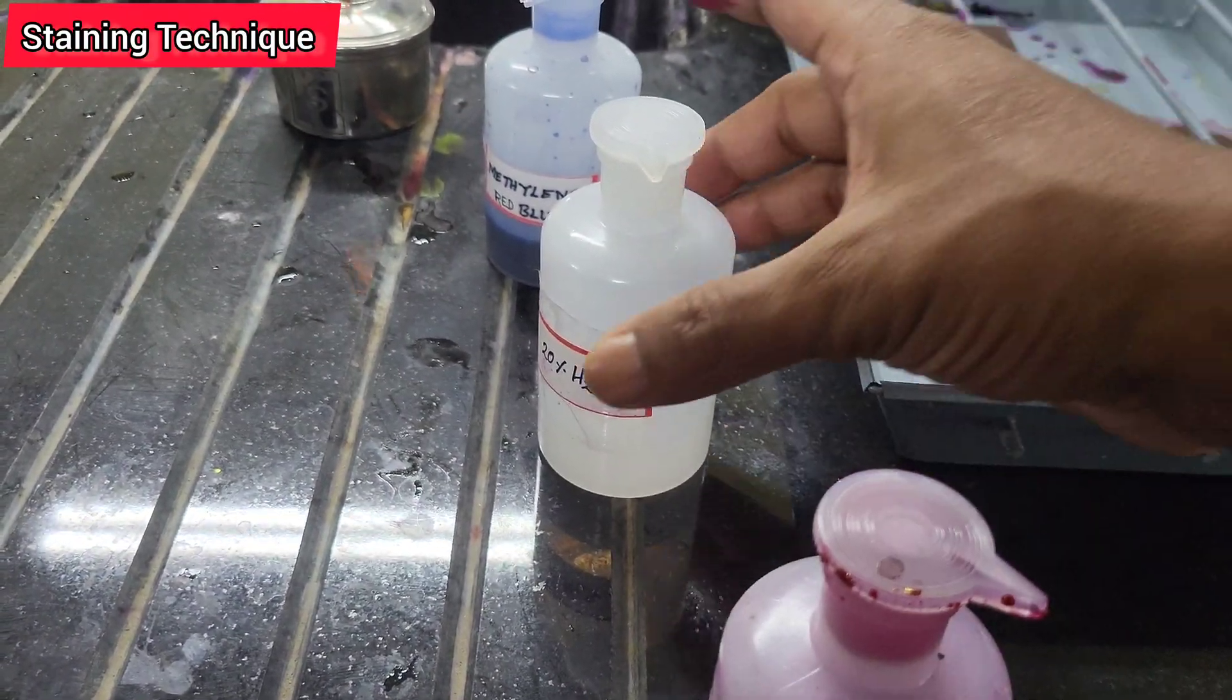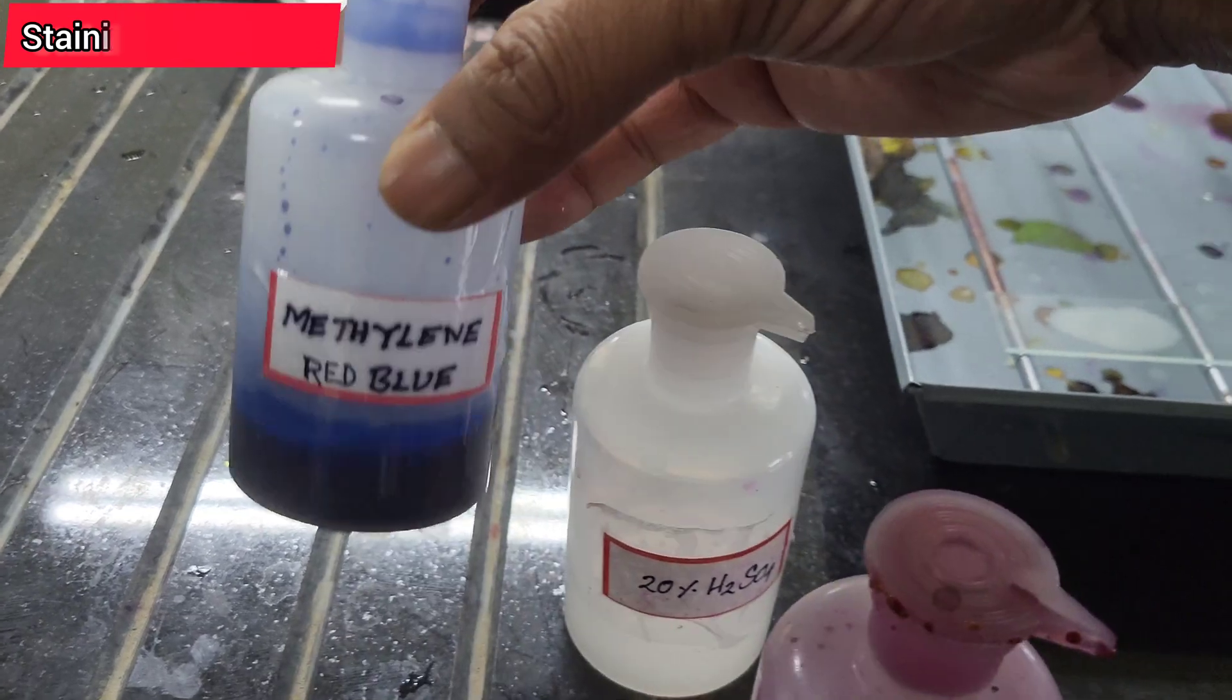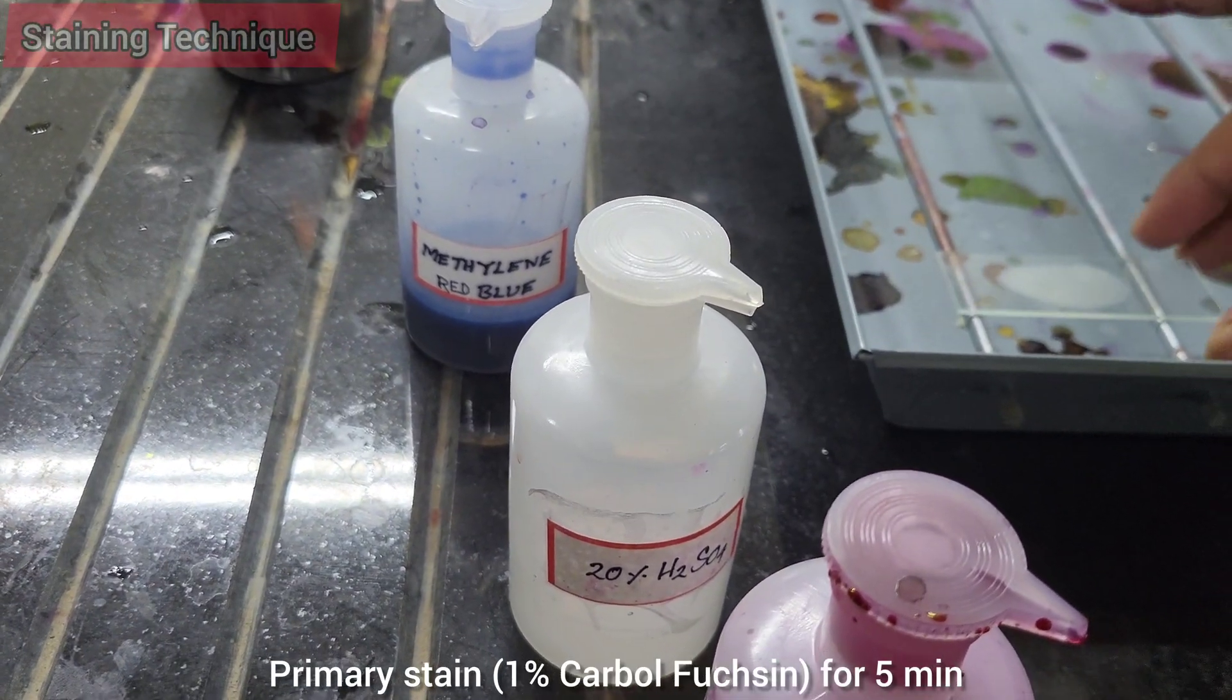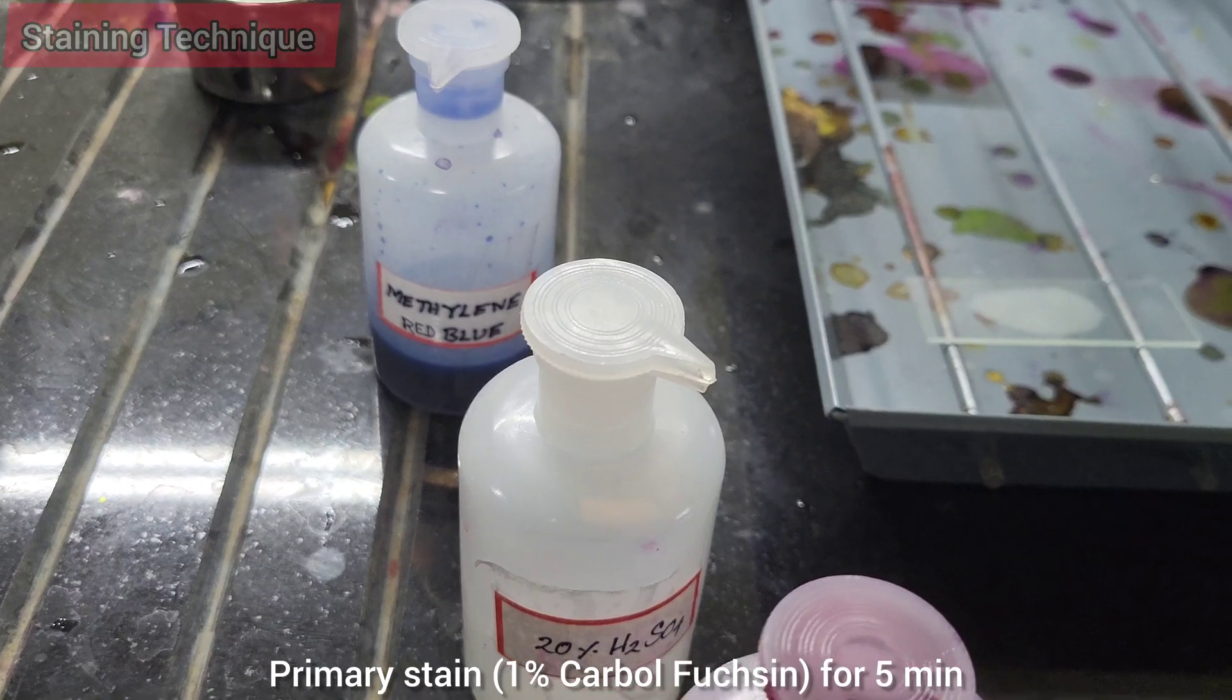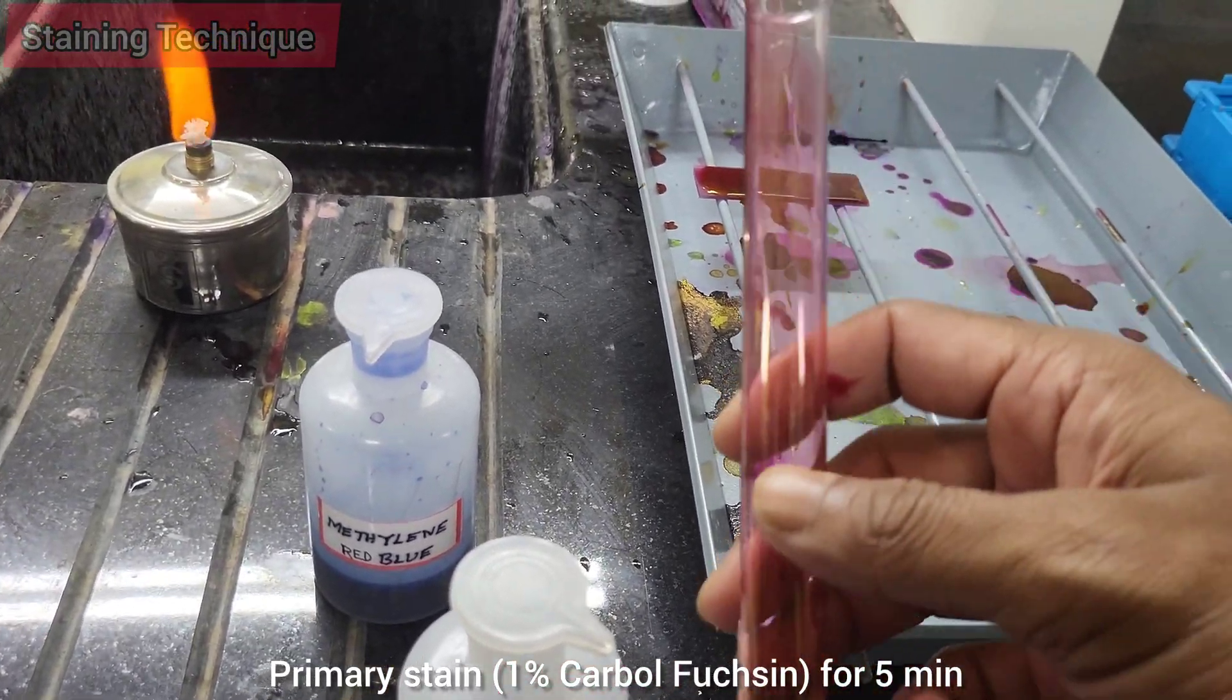Now it's time to stain the slide. For this we need primary stain carbolfuchsin, decolorizer, and a counter stain methylene blue. First step is primary staining. There are two ways: first, cover the smear with carbolfuchsin then heat gently using Bunsen burner or spirit lamp from bottom until the vapor arises.